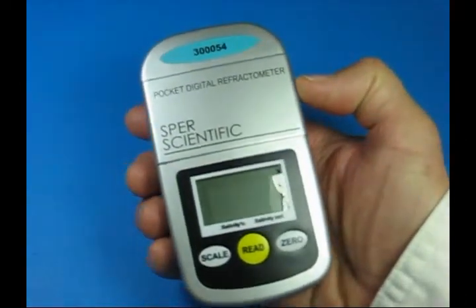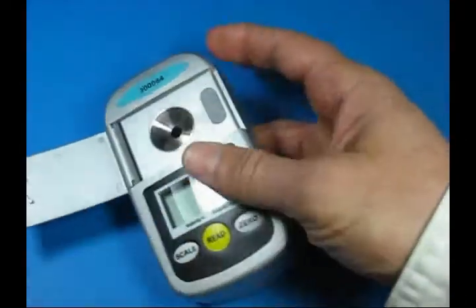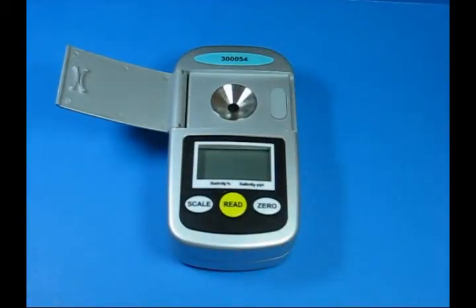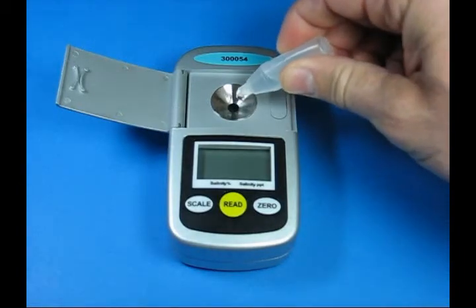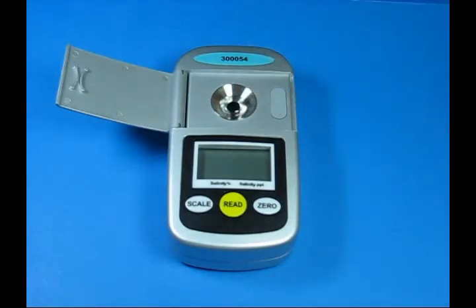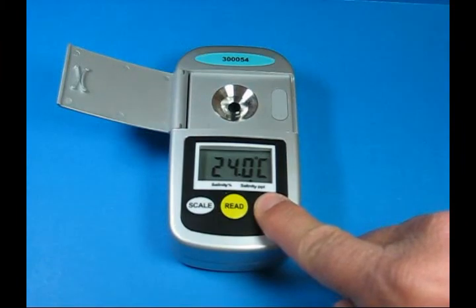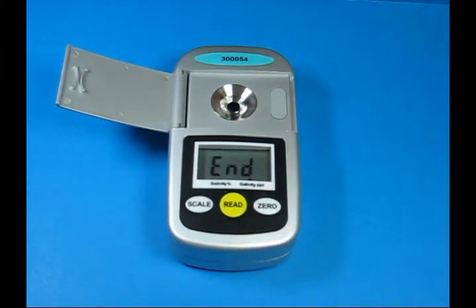Our new pocket digital refractometer is a small unit that calibrates easily to distilled water, regardless of the scale being measured. All we need to do is put a few drops of distilled water, turn the unit on, and press the zero button, and the unit is calibrated.